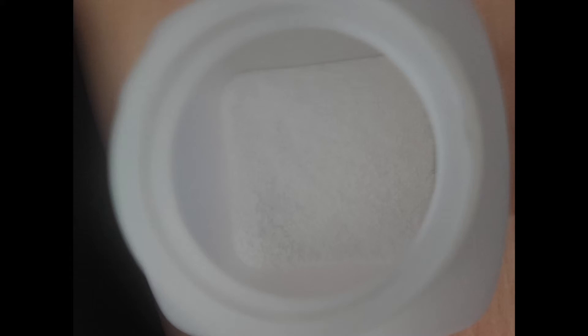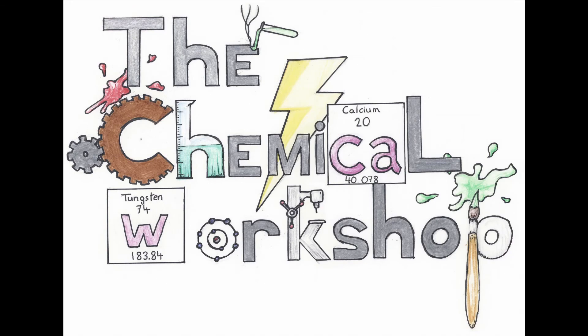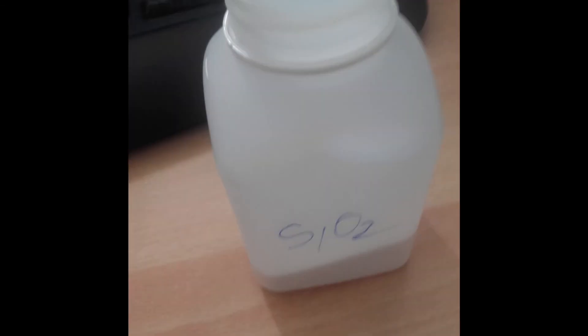Also we didn't calculate our terrible yield because it really is terrible and we currently need a bit better scale. So here you go, quite pure silicon dioxide.